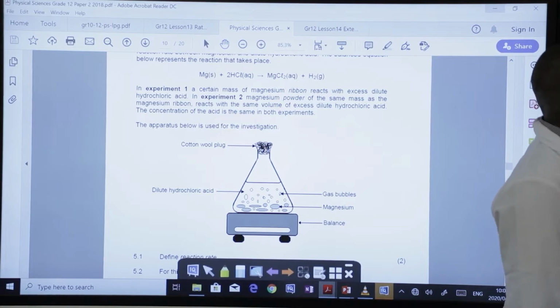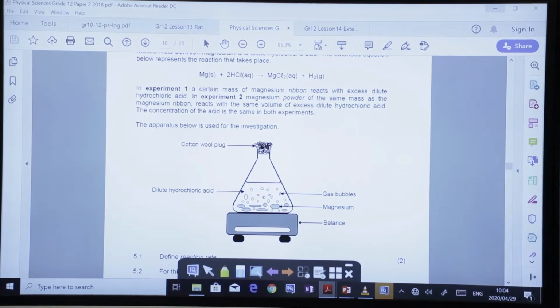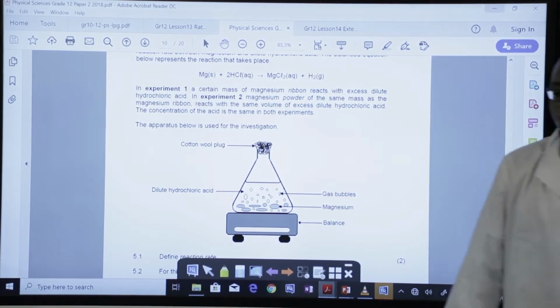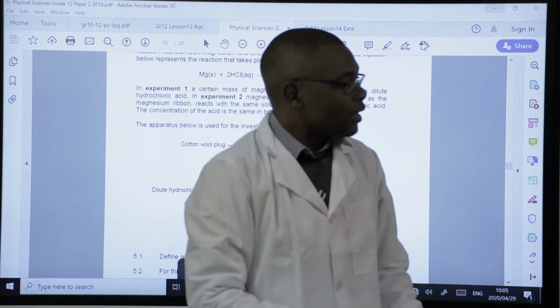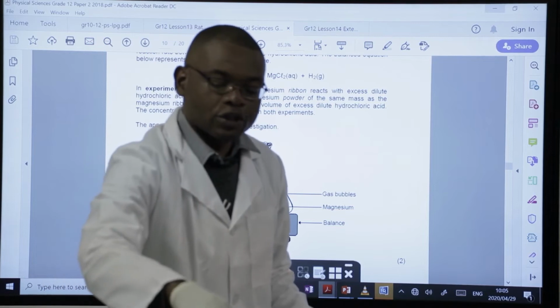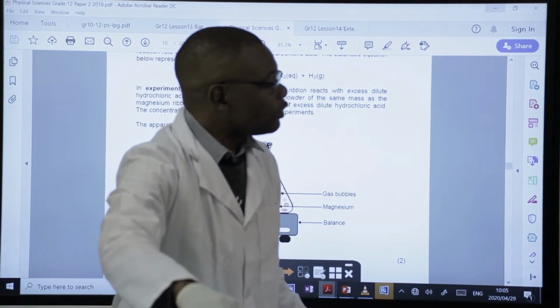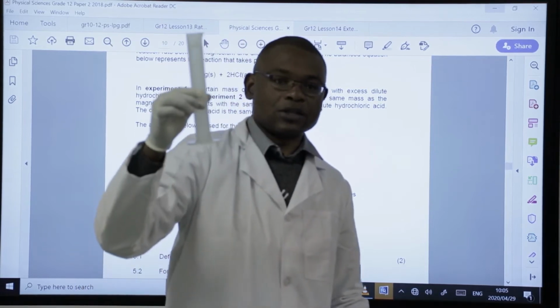So if I do my calculations very well, I make V1 the subject of the formula. So 18 molar comes this side to divide it. So 1 times 0.1 divided by 18 will give me a certain value which I'll multiply again by 1,000 to find the cubic centimeters which I am going to measure from a measuring cylinder and transfer into a 100 ml volumetric flask. So my solution of 1 molar hydrochloric acid is this one.